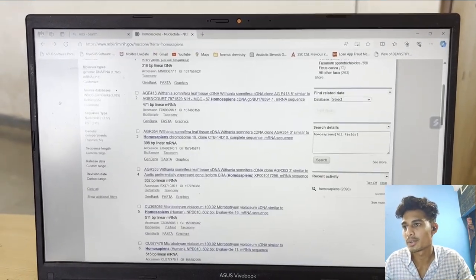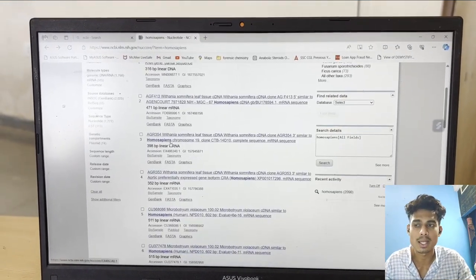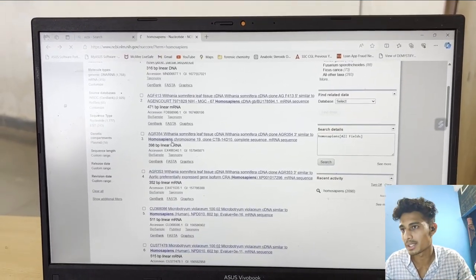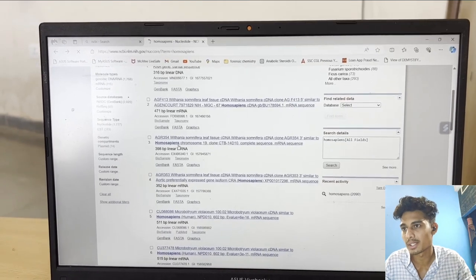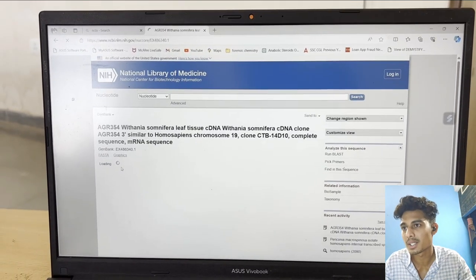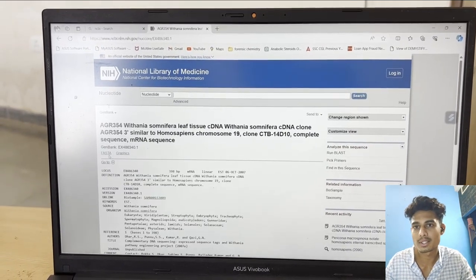We are going to select nucleotide, and in this video I have selected Homo sapiens and then search.